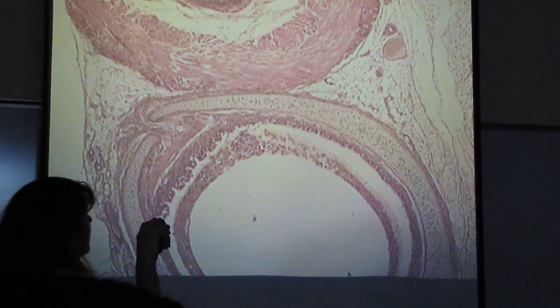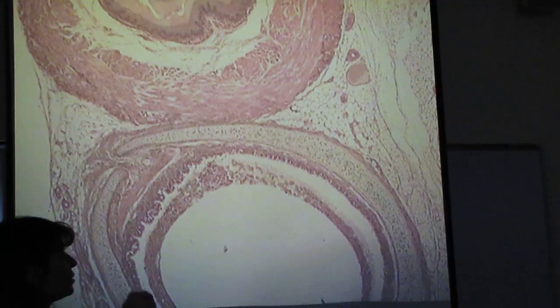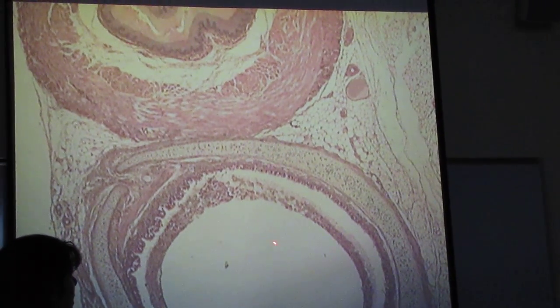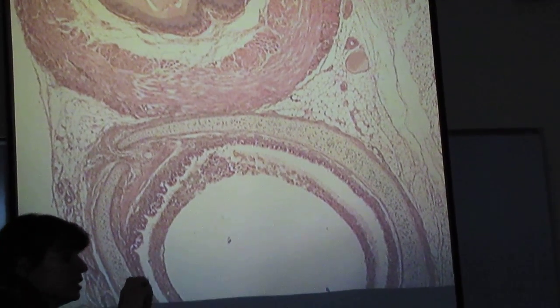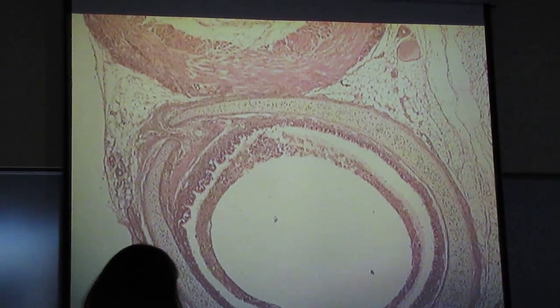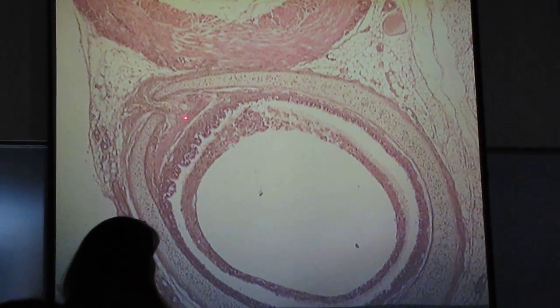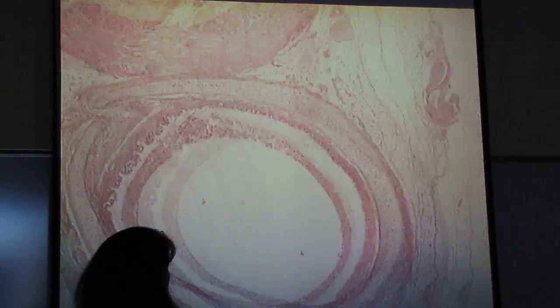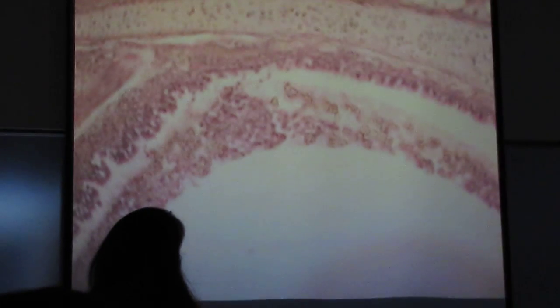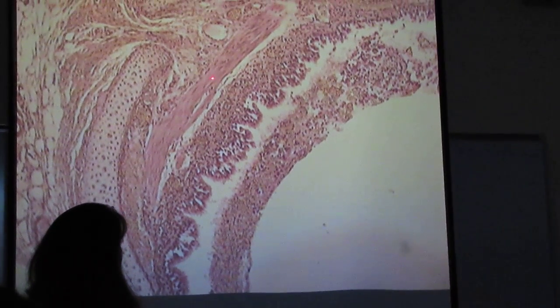Number 2 is identify this organ surrounding the pointer. Okay, so number 1 is trachea. Number 2 is esophagus. Question number 3 is identify this structure right there. Identify that structure. I'm going to put it one higher power. Right here. Identify that structure right there.